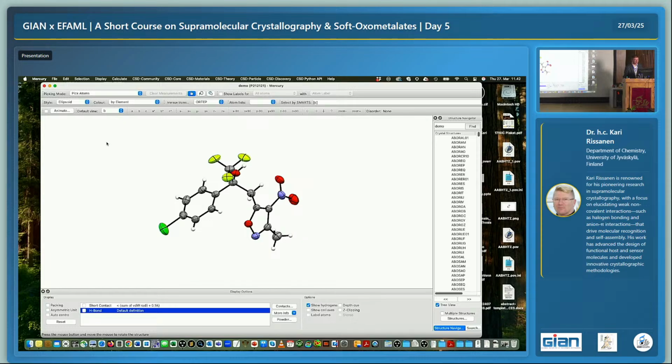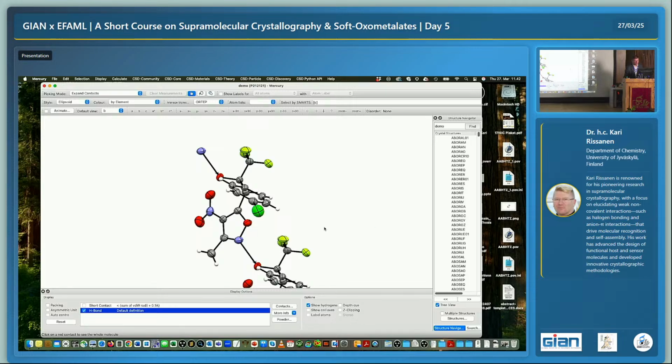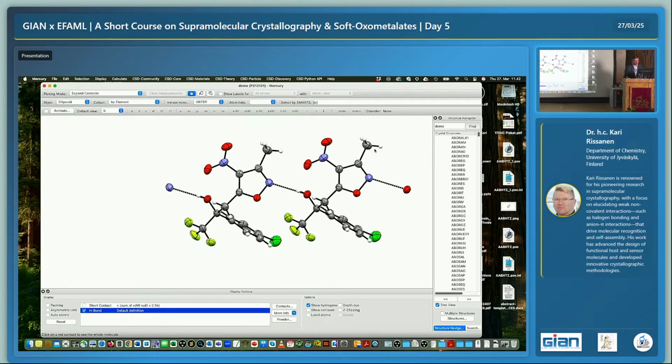I will now ask it to look for one hydrogen bond on. Let's take this one. And now, if I unclick this one, it doesn't show anything else then. Now it doesn't show the hydrogen bond anymore, but now we know that there's a hydrogen bond. But there is another trick, because in real life, these don't exist. Of course, this is just a presentation. Like in here, there's no such bond here. This is only embedded, it's right there. So this is just presentation.